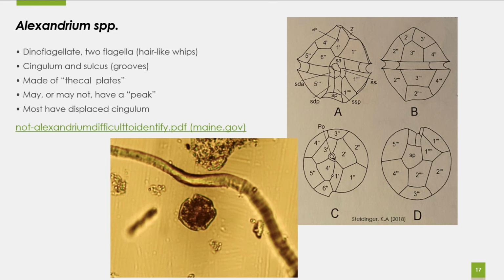But it's really instructive and helpful for them to know what they're looking at, whether it's Alexandrium or not, because we are trying to build a sense of how many cells it really takes before we start seeing toxicity. Brooke said we're being super conservative with this. If they see one cell, they report 75 cells per liter, and that's enough to do the test. But we're doing the test.